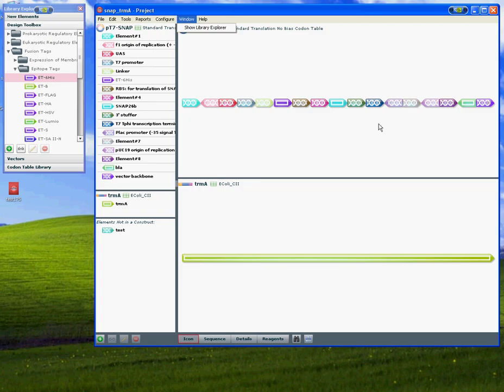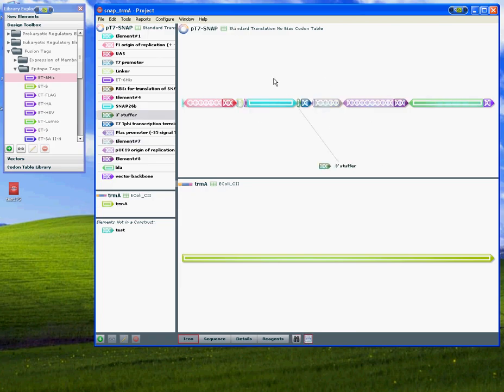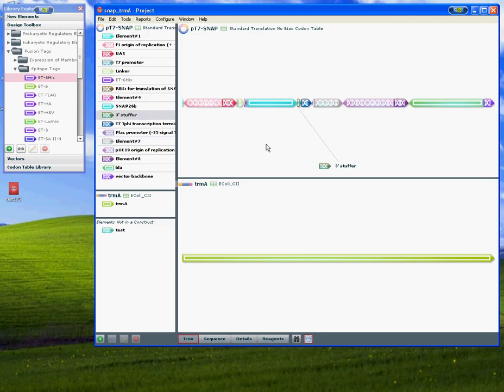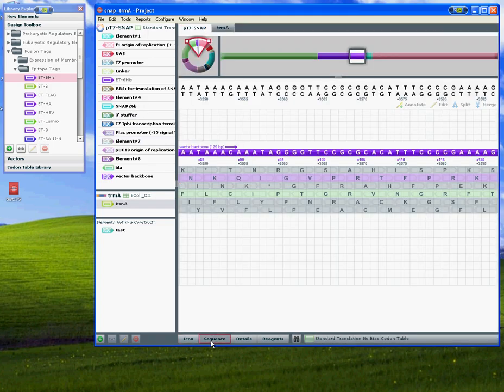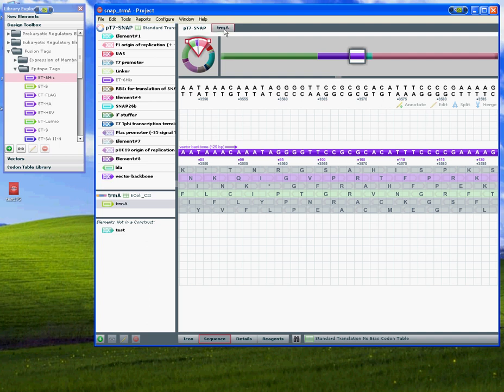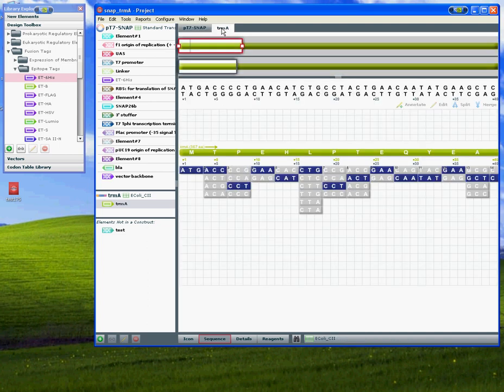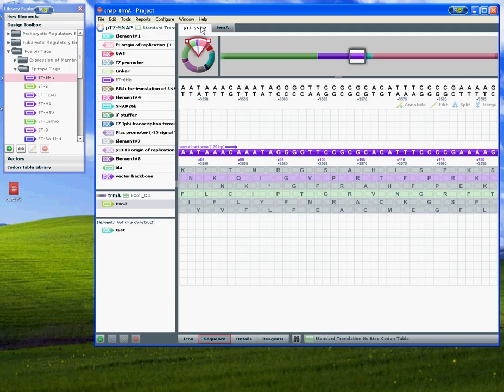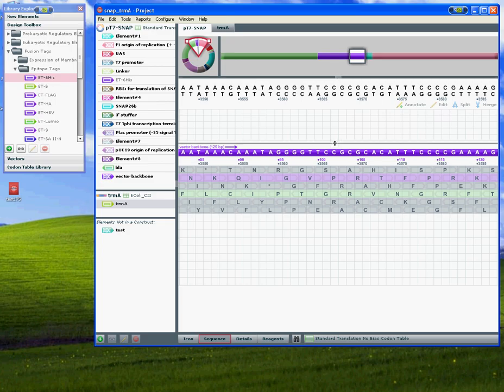Here you see the icon view for that construct in a proportional view. You can also look at the sequence view for these constructs. Here's the sequence view for the T7 snap, and here's the tab for the trim A gene. Within the T7 snap, because it's a circular plasmid, you can use the telescope view to orient yourself.